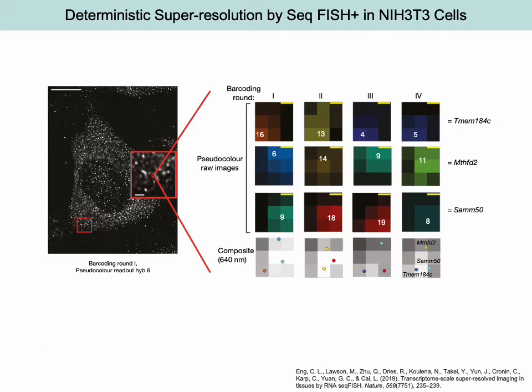And you can think about this way of doing super resolution microscopy, because you can control which molecule is turned on and turned off. It happens deterministically, and each time a dot lights up, it is made of tens of dye molecules because you have many dyes on the original molecules. In this way, you increase the signal levels, and you guarantee you can detect something over time.